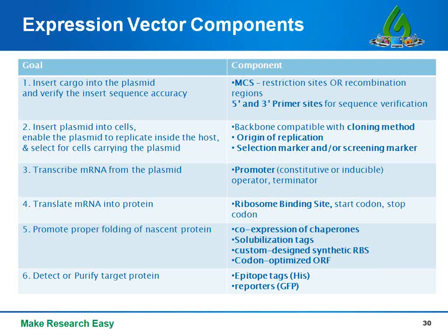You could use a constitutive promoter, or you might want to use an inducible promoter. You've also got to think about the terminator at the 3' end of your target sequence, because transcription termination is really important for making sure that you get full-length sequences that are transcribed and released at an efficient rate.